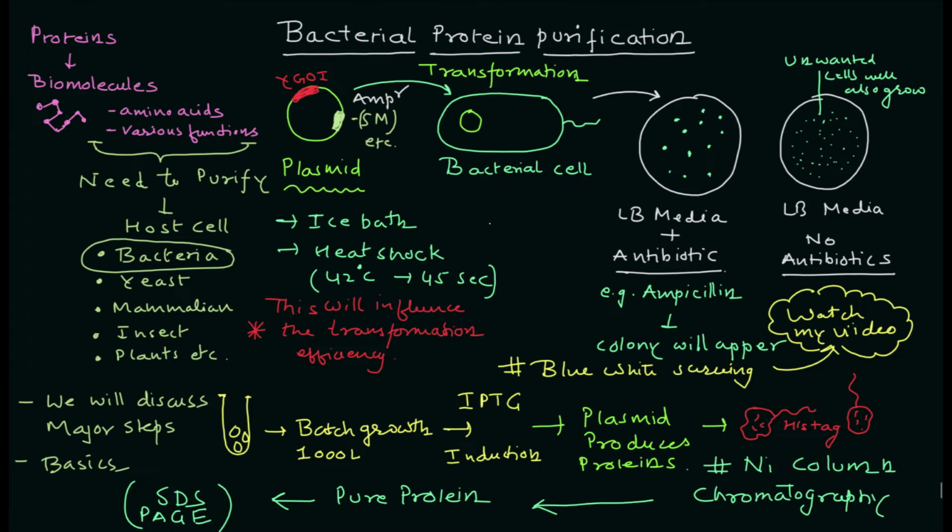Yes, you definitely need some equipment, and it is routine, but you don't need too expensive things to complete this project. You need a plasmid, a bacterial cell, and media plates. You need to know how to lyse the cell and how to grow the cells. So, basic equipment. First, you have to purify the plasmid. If you have a pure plasmid, transformation will take at least 1 day.